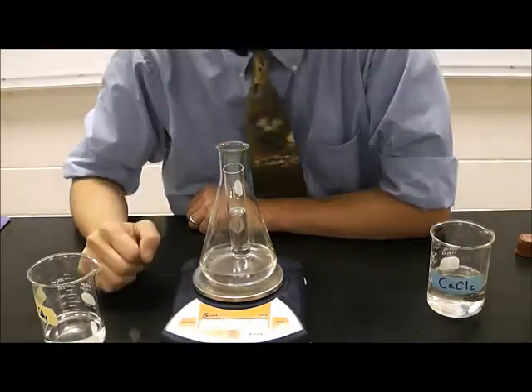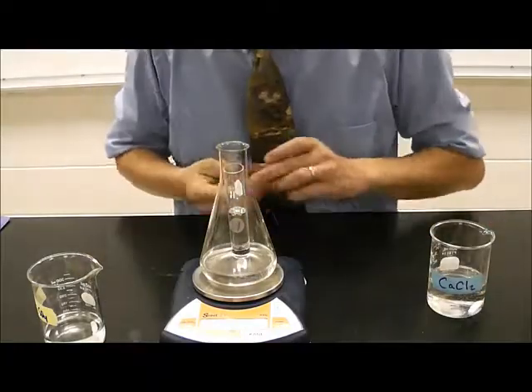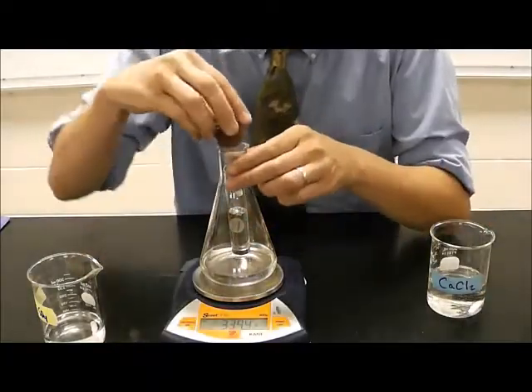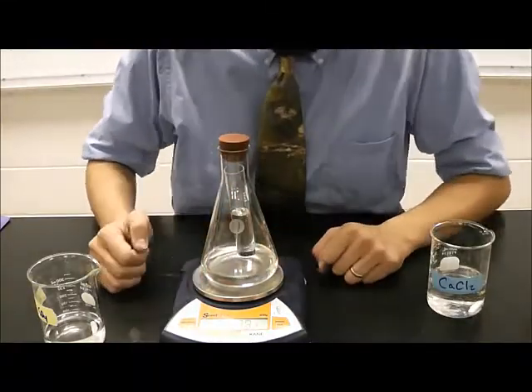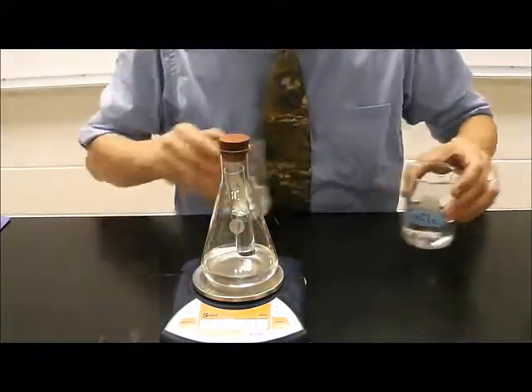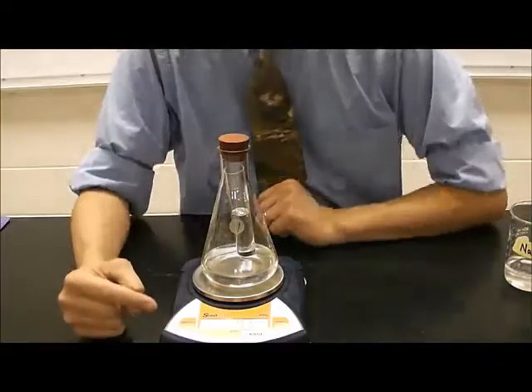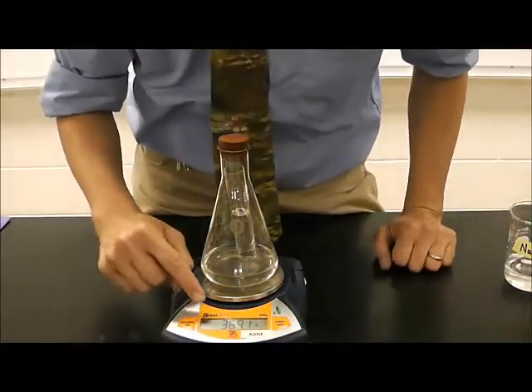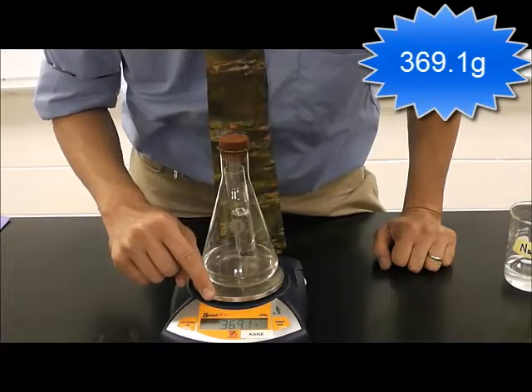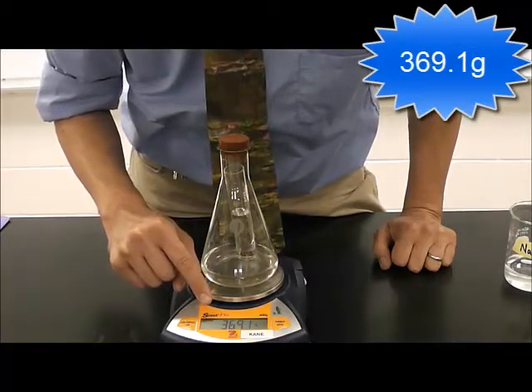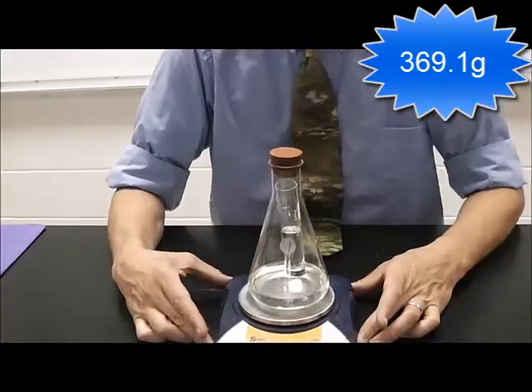Notice that the two chemicals are not mixing yet. I'm also going to use a stopper to stop up the top of the Erlenmeyer. And we are now going to note the current mass on the balance. You should be able to read that. It says 369.1 grams.